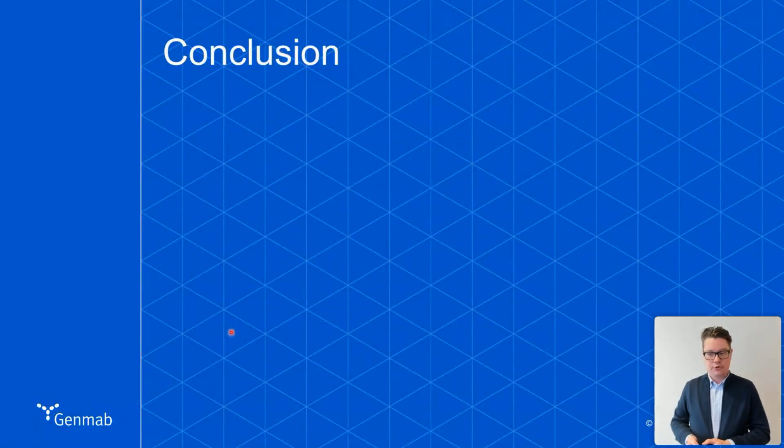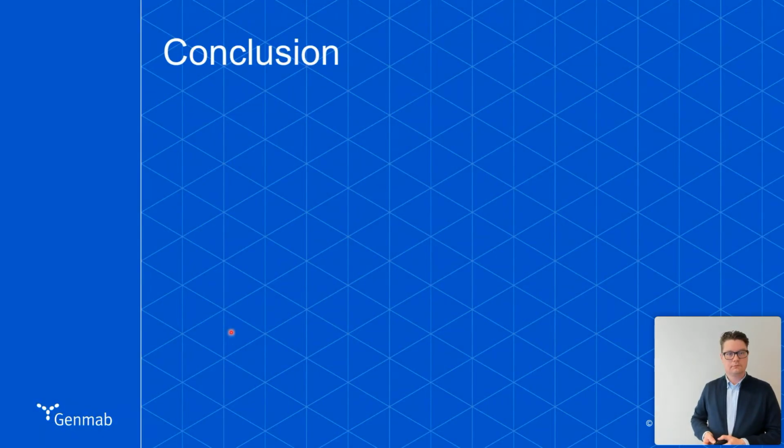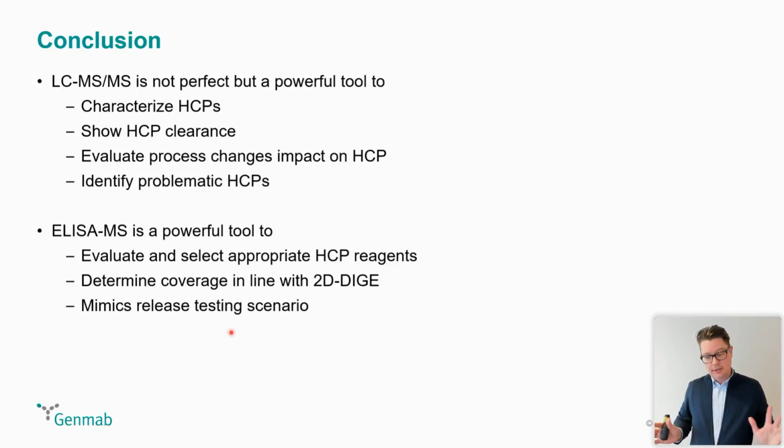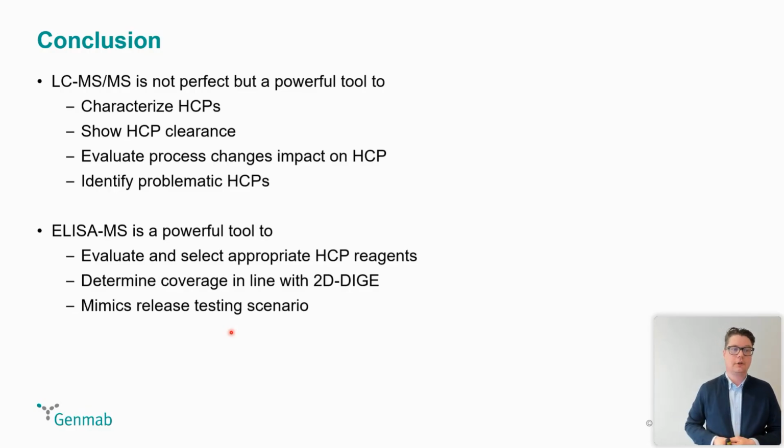So, a little conclusion to this. We find that LC-MS for HCP characterization is a very powerful tool. It's not a perfect tool. I know there are a lot of people out there who have issues with quantitation, dynamic range, sensitivity, and so on.